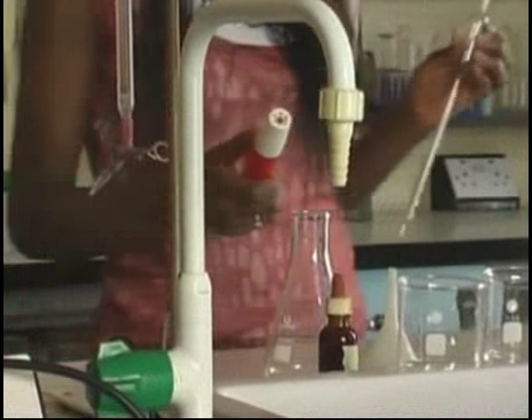Hello and welcome back. I'm going to carry out a titration using sodium hydroxide and hydrochloric acid as my reagents. First, I'm going to use a pipette to get 25 cm cubed of sodium hydroxide.